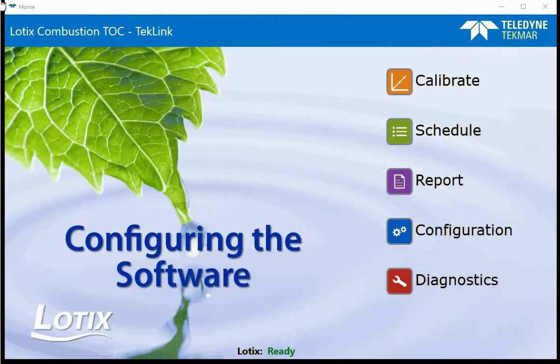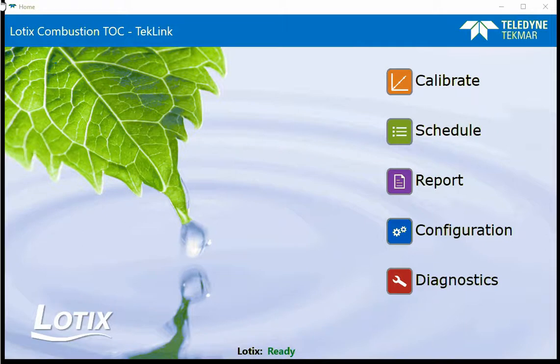When selecting the Configurations button in the Lodix TOC TechLink software, it allows changes to be made in several categories.